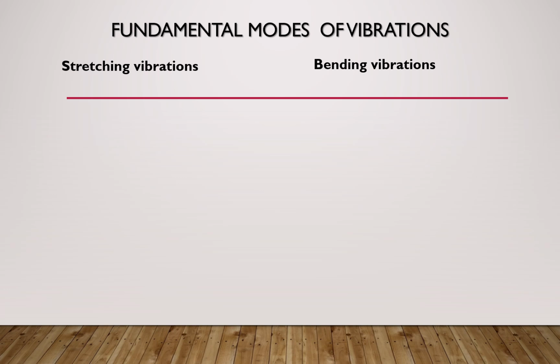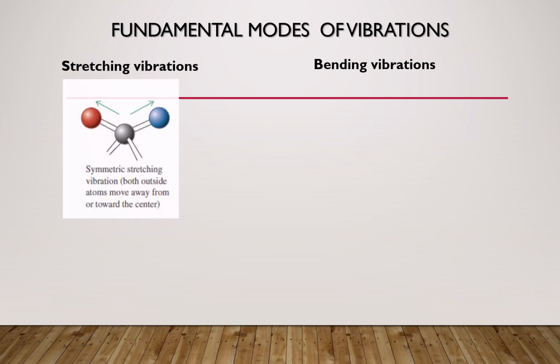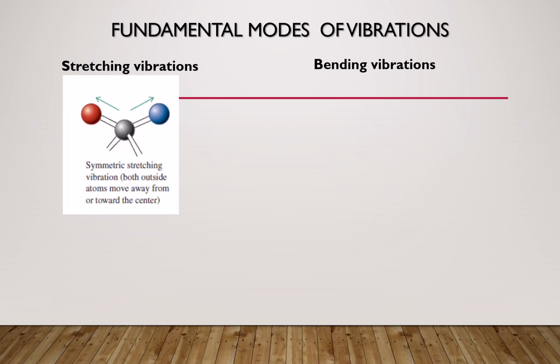Now let's see what the fundamental modes of vibration are. When a molecule absorbs infrared radiation, there are stretching and bending of bonds. These stretching and bending vibrations are again divided into different classes or categories. Stretching vibrations can be of two kinds.